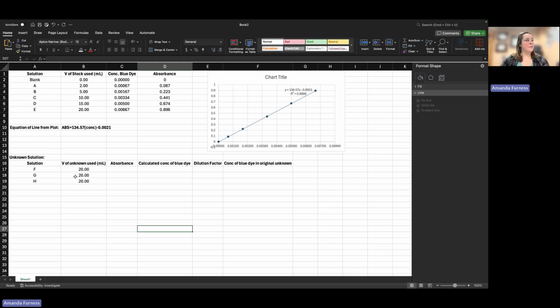unknown. And so for my unknown, if we're thinking through this process, essentially your unknown, the sample that you got in your specimen vial that had the code on it, that's more or less the equivalent of the stock that you got out of the hood. Okay, so think about it that same way, right? But this time we don't know what the stock is. So in this case, we're technically looking for M1, right?